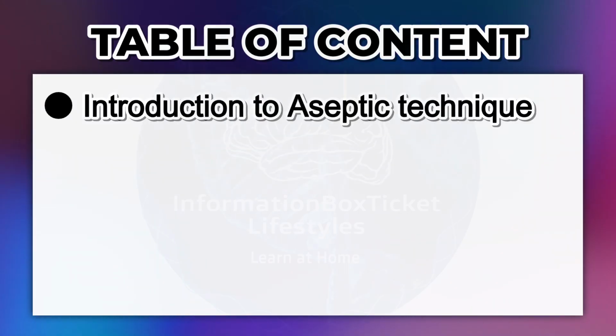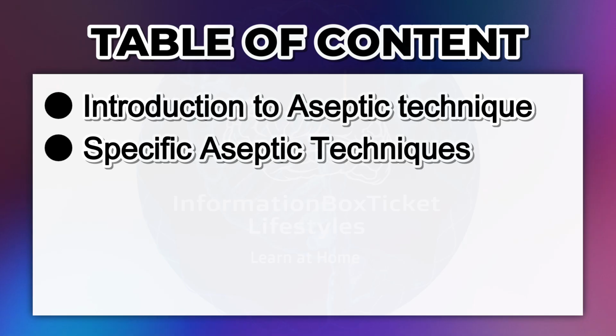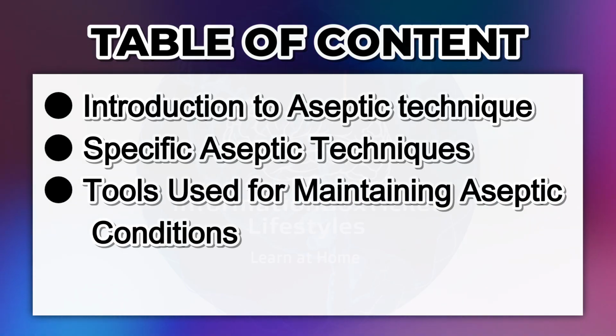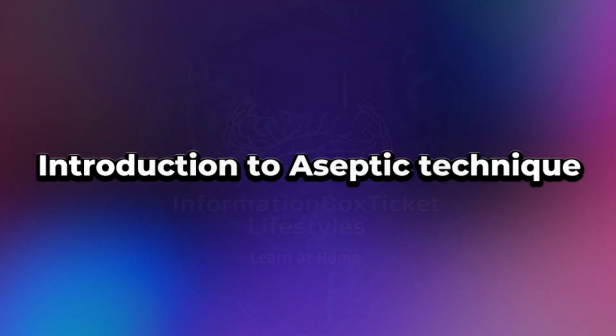Table of Contents. Introduction to Aseptic Technique. Specific aseptic techniques. Tools used for maintaining aseptic conditions. Introduction to Aseptic Technique.